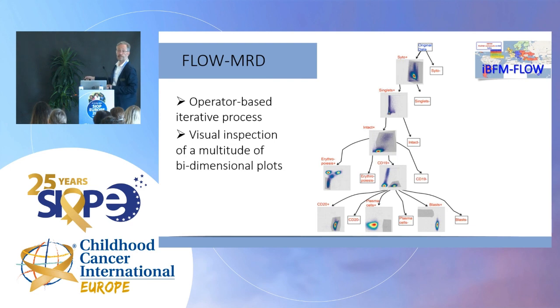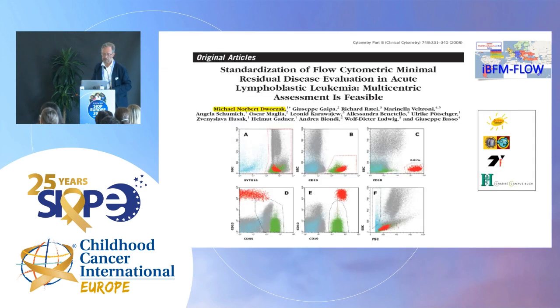The first hub usually in B-ALL is CD19, and in T-ALL is CD7, and in AML I will briefly touch that a bit later. And then you look for all the other marker combinations by visual inspection. This is how it's usually done. Nowadays there are tendencies to do this with automatic, IT-driven interpretation, but this is not the theme of today.